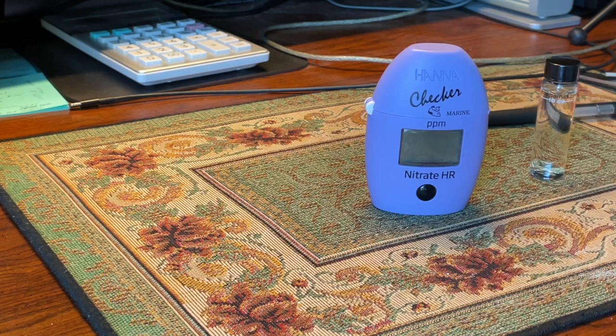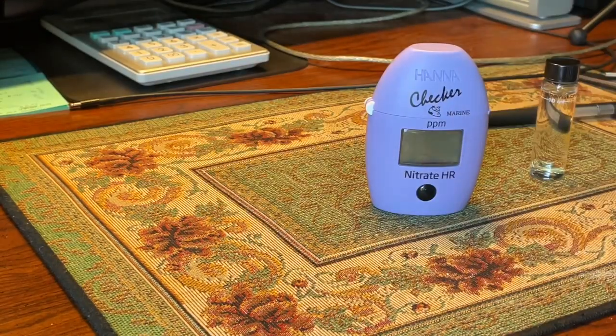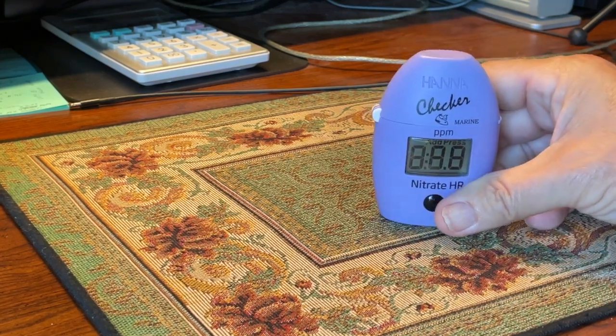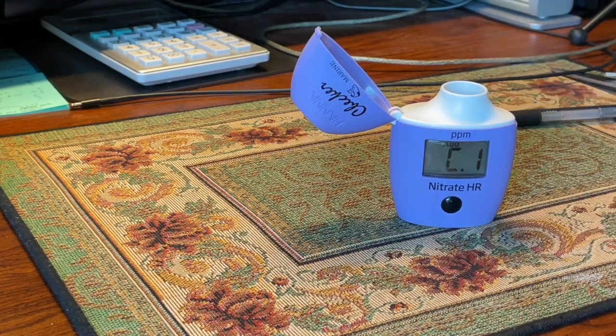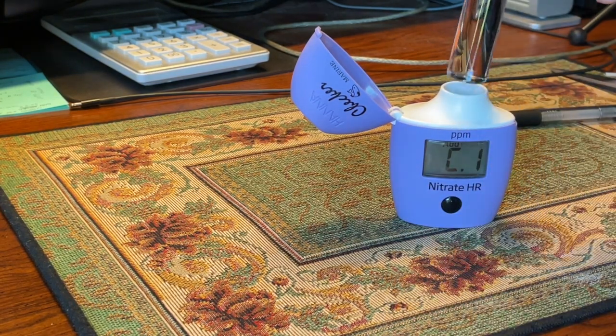I also tried it at five parts per million and all three kits read the same. The API isn't quite as accurate as the Hanna or the Lamont, but it's good enough for a hobbyist. If you want something easy, this is it — all you have to do first is turn it on by pressing the button once. You can wipe down the vial with a rag to remove fingerprints, fill it with your aquarium water, and close it up.